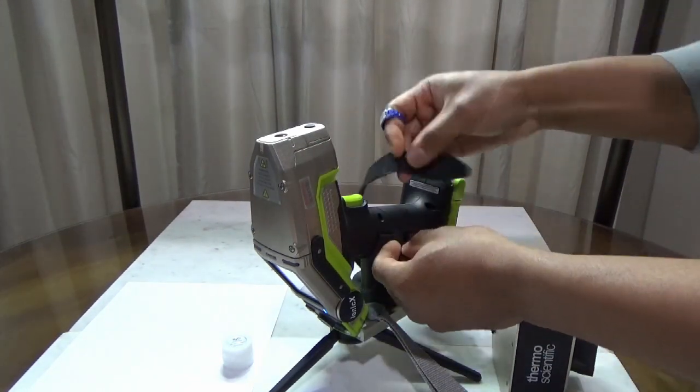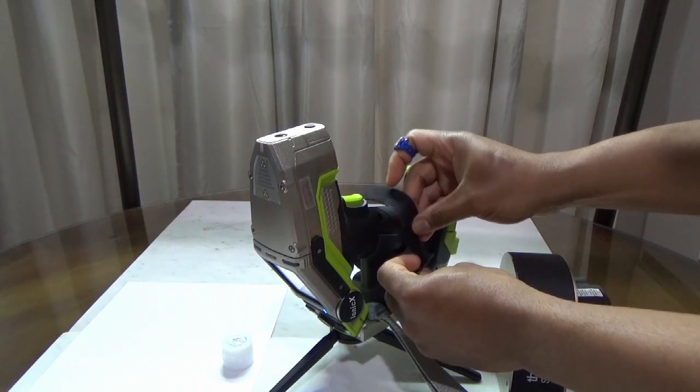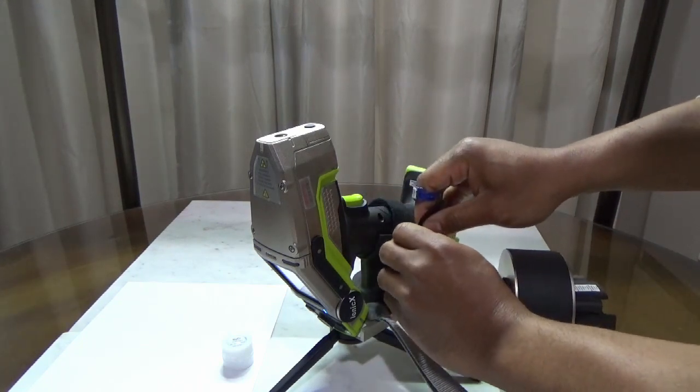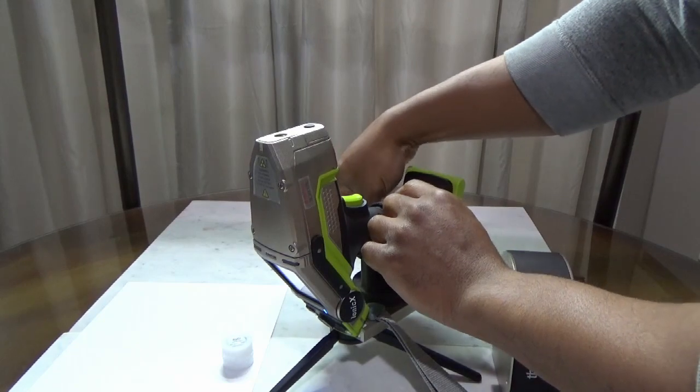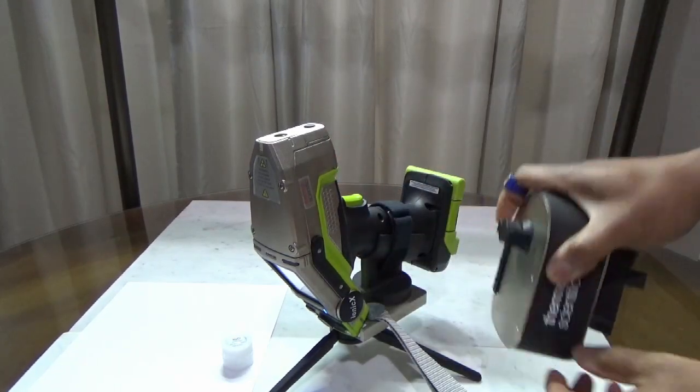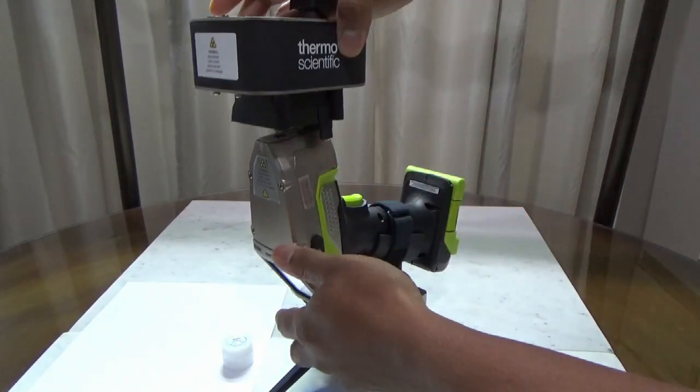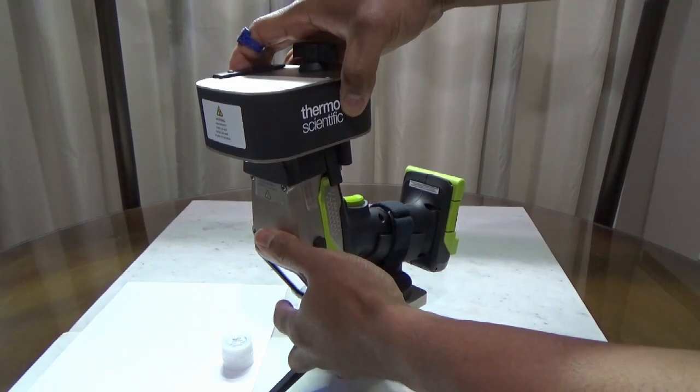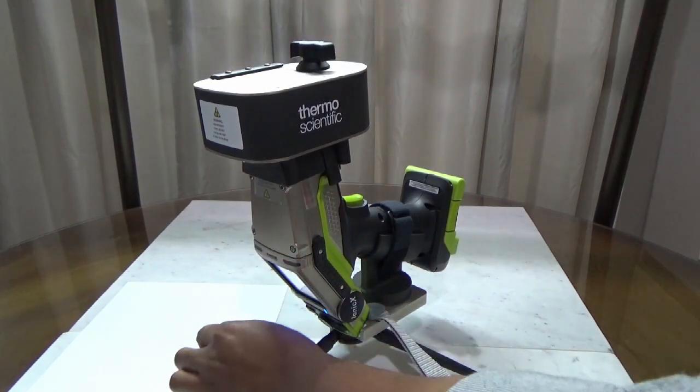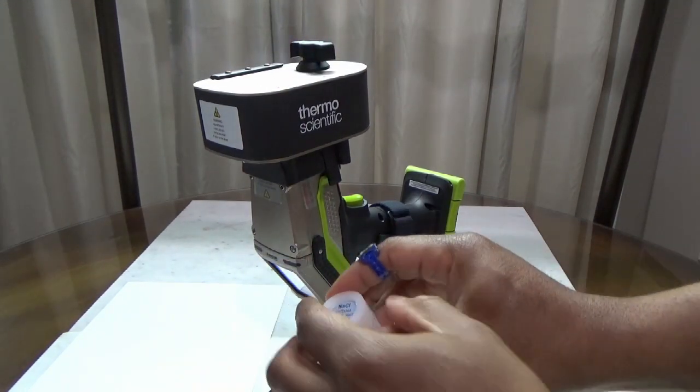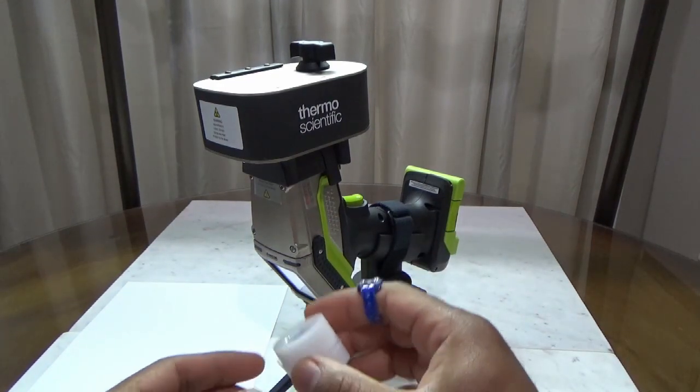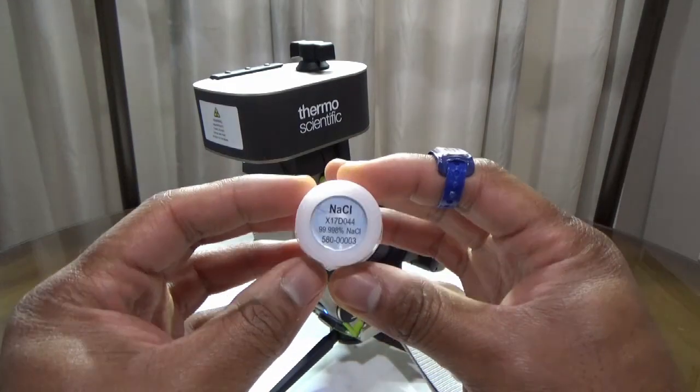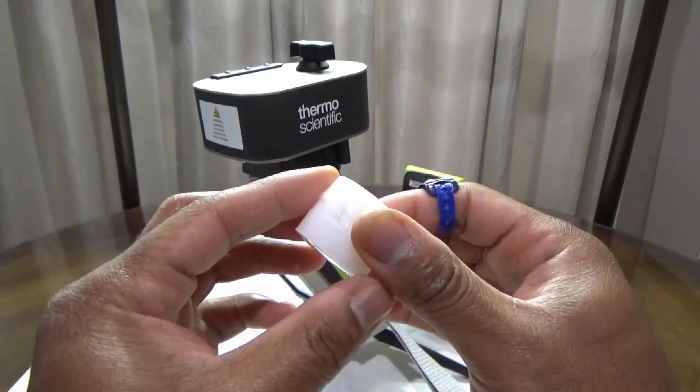The IONIC-X system comes with a two-part mini test stand accessory that is required for routine use. The bottom half cradles the XRF analyzer and secures the instrument in place. The top half of the test stand serves as both a sample holder for analysis and safety interlock. The instrument will not function without the sample holder securely connected. Samples themselves are prepared in advance using small XRF sample cups.